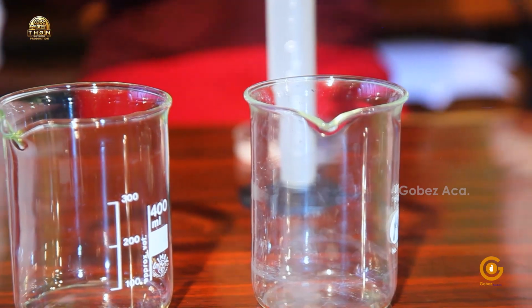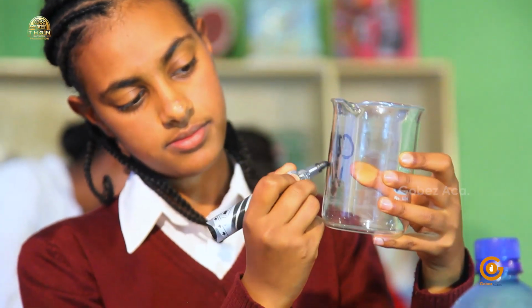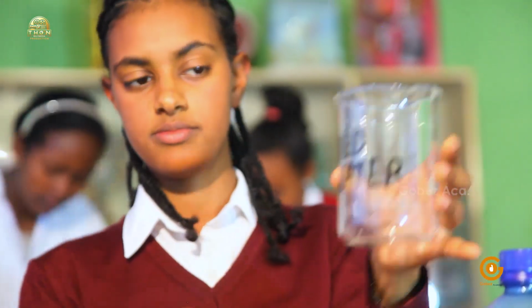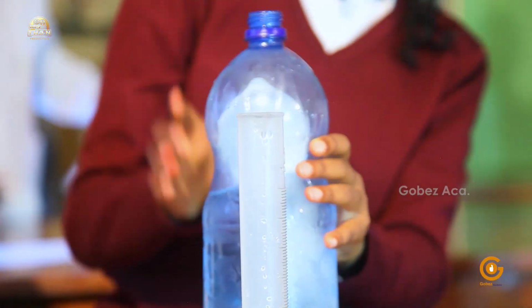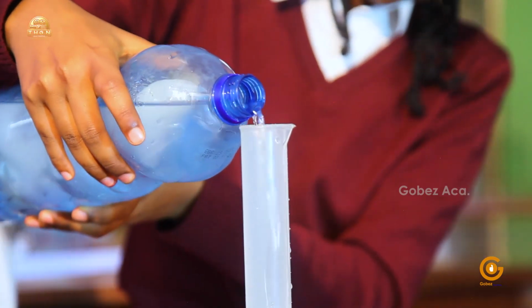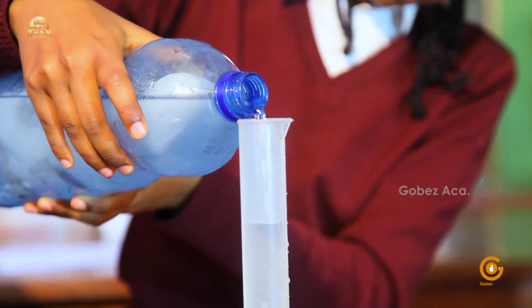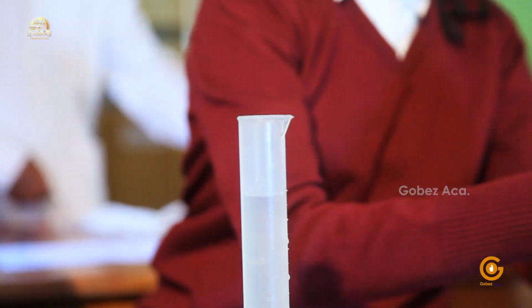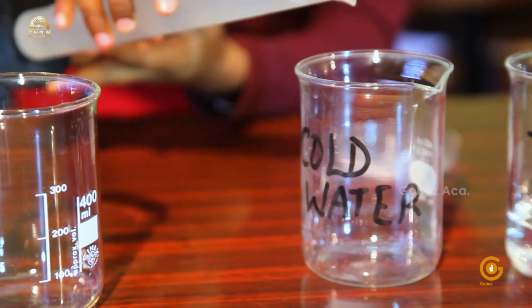As I did before, on the second beaker, I write cold water. And put into it water from the fridge.